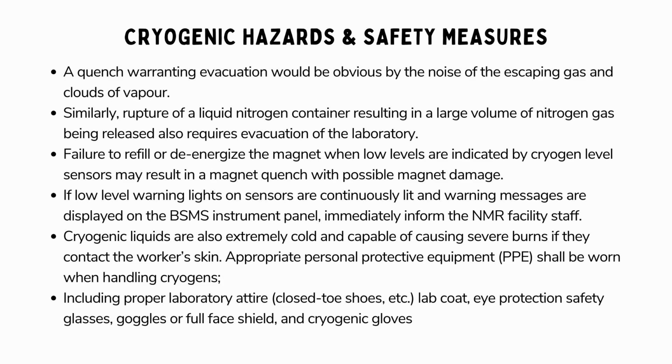Cryogenic hazards and safety measures. Evacuation is necessary when there is a loud noise from escaping gas and clouds of vapor. If a liquid nitrogen container ruptures and releases a large volume of nitrogen gas, the laboratory must be evacuated.